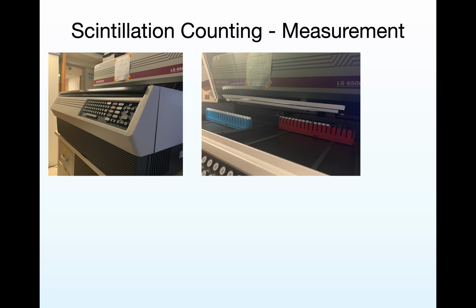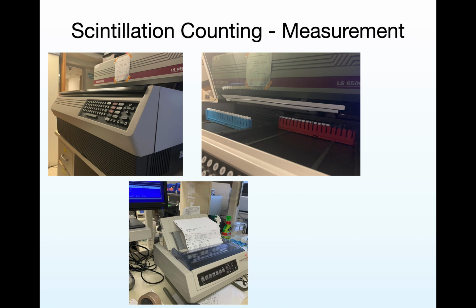You put these little cards on the back and it identifies, like this little Hulk card on that red one at the end. So basically it's really old school. It's so old school, it prints off on a dot matrix printer, and the computer won't save anything, so the only readout you have is that printer. So you're deathly afraid the printer's going to die.